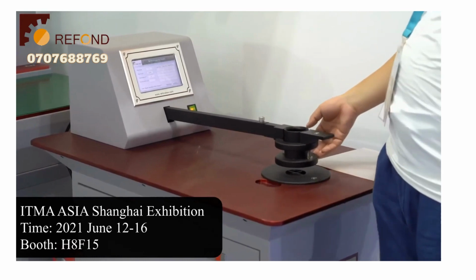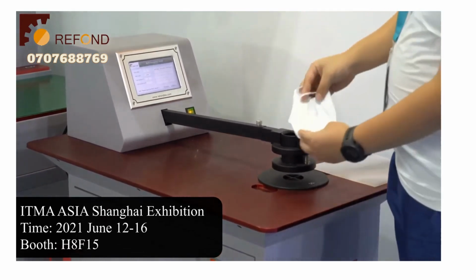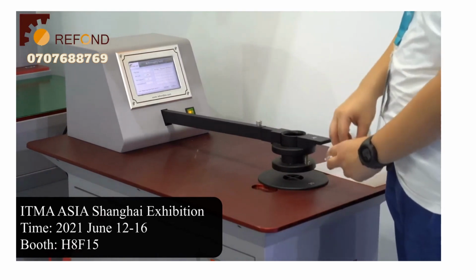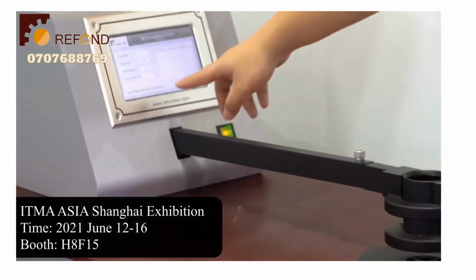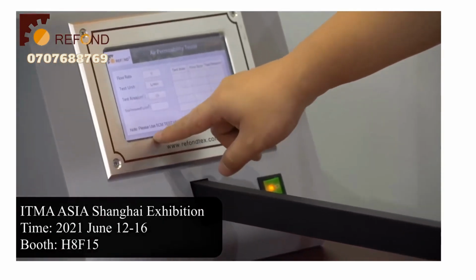The fixed flow rate test is a measurement of the breathability of a face mask. It's also called the flow resistance of the face mask. So it measures how difficult it is for the air to move through the face mask. For this test, you need to use the 5 centimeter squared test head. We have a reminder up here on the touch screen for reminding the user.